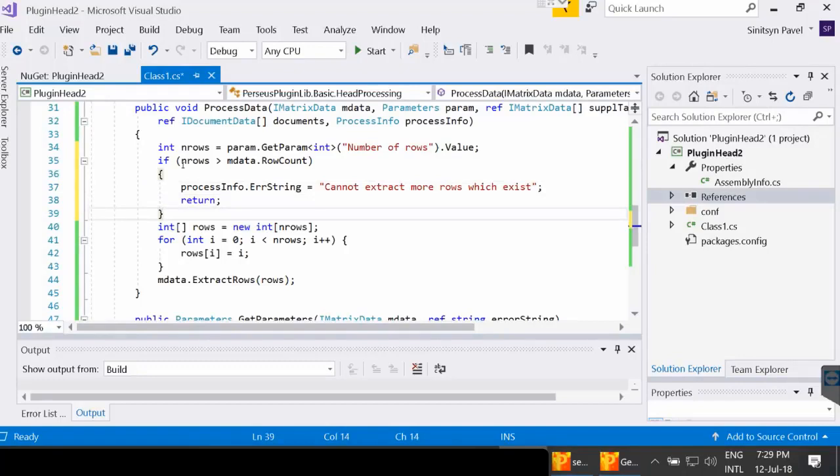You know what's going to happen? I know what people usually do. They take negative numbers. You know what happens with negative numbers? We are going to create an array with negative length, which also won't go well. So maybe also check that it's larger than 0. You see, less than 0. So we really should deal with all possible scenarios, and there are many scenarios. It really depends on your imagination.